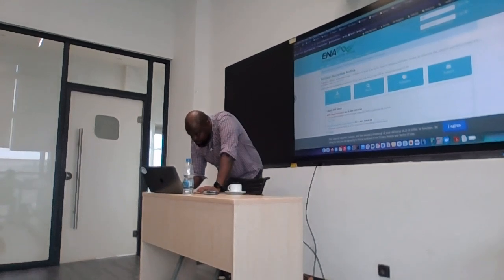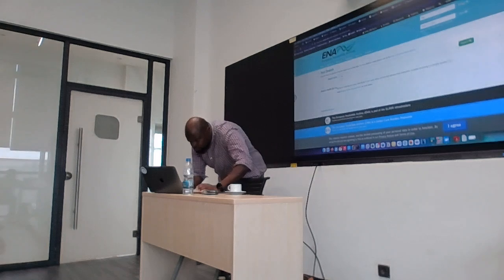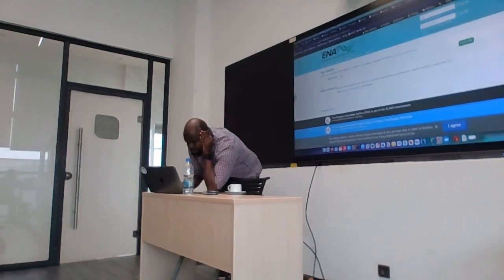That is very interesting. Don't know what's happening. Does anybody have an idea why my search is not working?